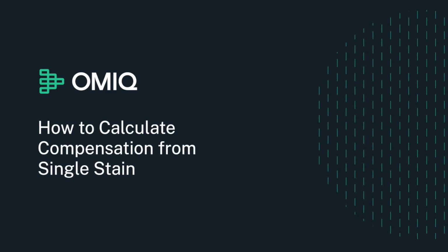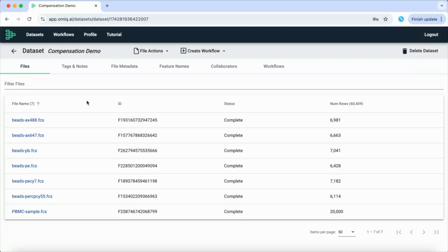Welcome to this video on how to calculate compensation matrices from single stain controls in OMIQ. For this example, I will use a dataset with 7 files. The first 6 are single stain controls for different colors in this experiment, and the last is an actual sample to analyze after correcting for compensation.